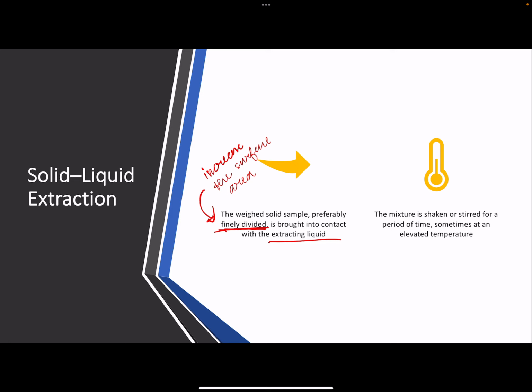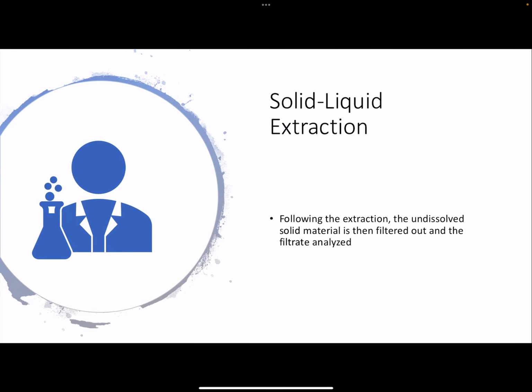Okay? The mixture is shaken or stirred for a period of time again to promote contact. Okay, following the extraction, the undissolved solid material is then filtered out and the filtrate is analyzed.